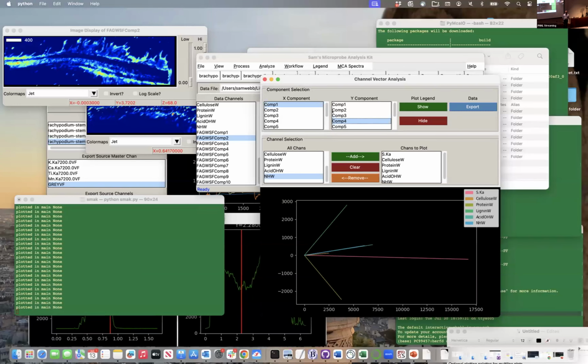And some people even circle their whole sample, one you can't even see with the naked eye, and they say, go here, and they draw a circle on it. It's like, oh, that helps. So it's amazing how even the low-tech solutions can be really good.